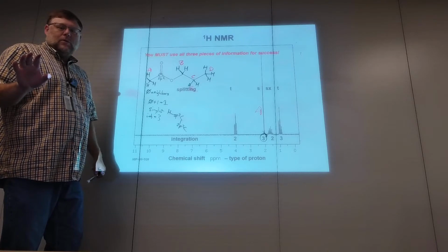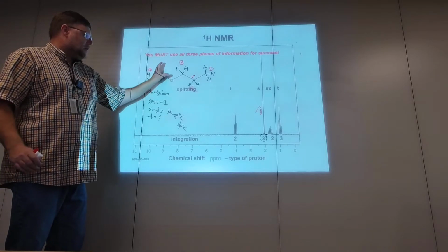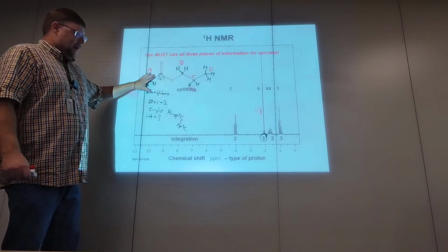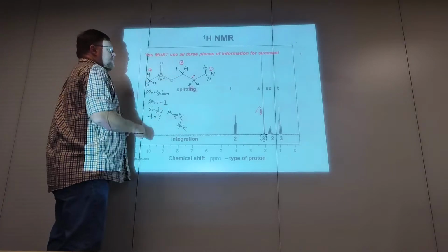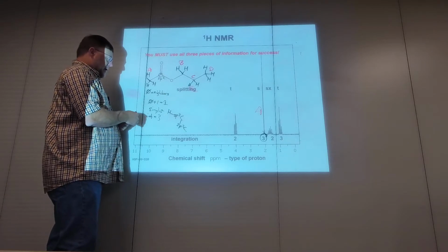Okay, so if you didn't know what was going on before, hit pause and assign B, C, and D if you learned something by my assigning A. Okay, hopefully you're back. So let's look at B. How many protons are there? There's 2. So it should integrate for 2.